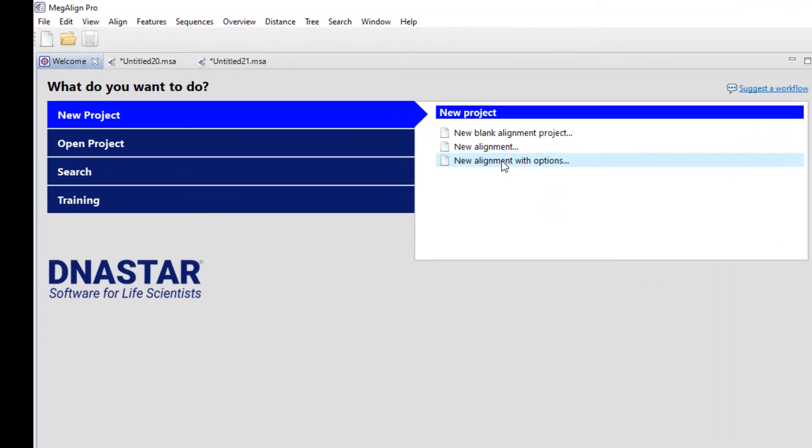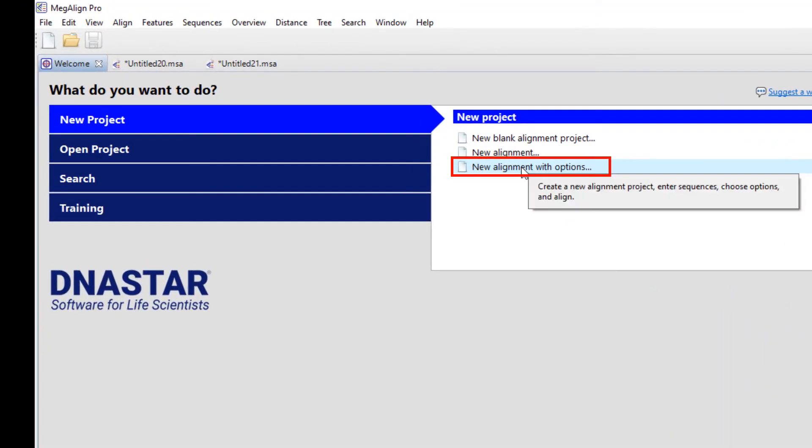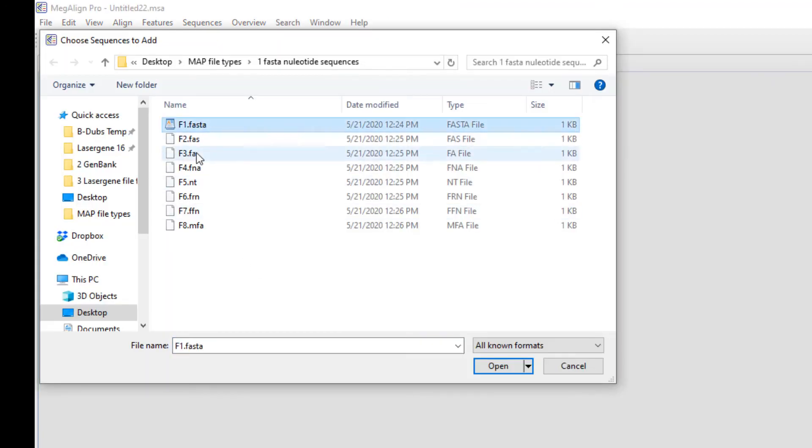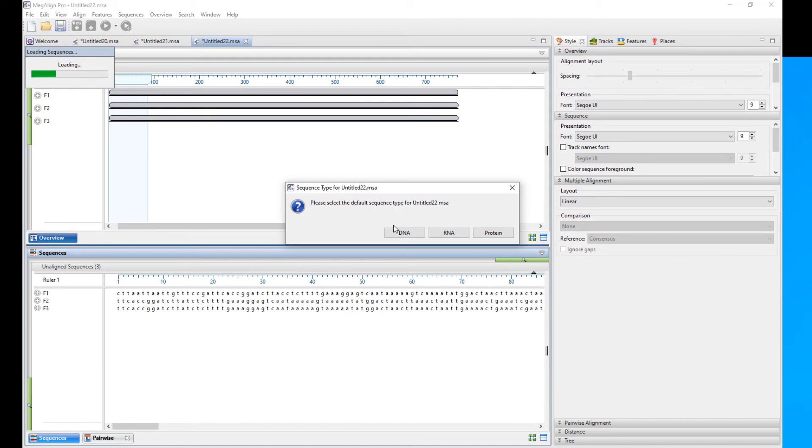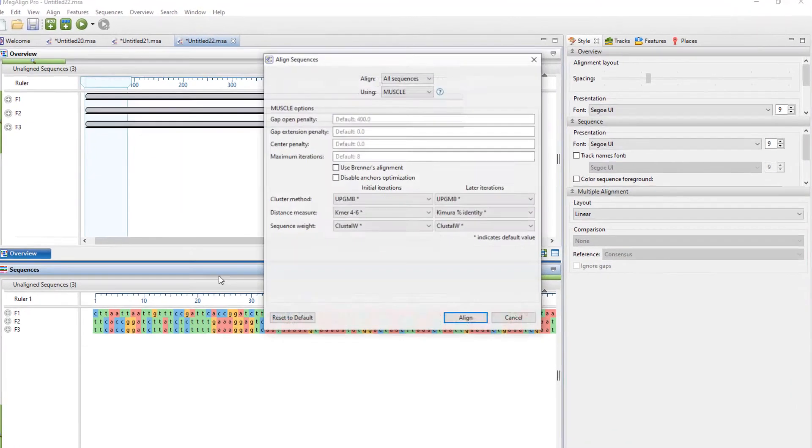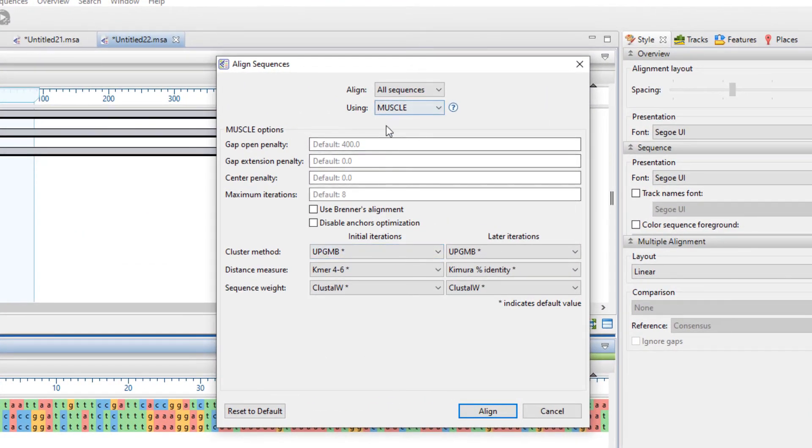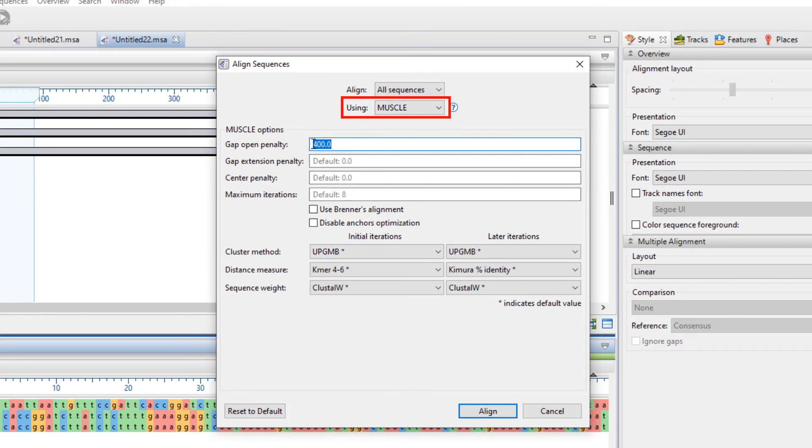The last option is very similar, except it allows you to choose your alignment options or allows you to alter the default parameters before proceeding. A little bit of a shortcut. Here I'm going to continue using muscle but lower the gap penalty.